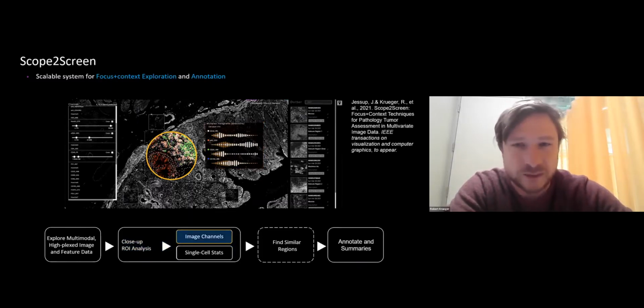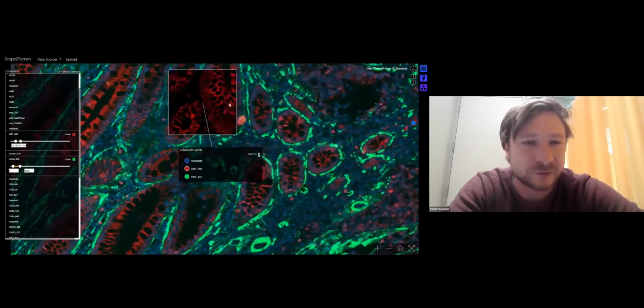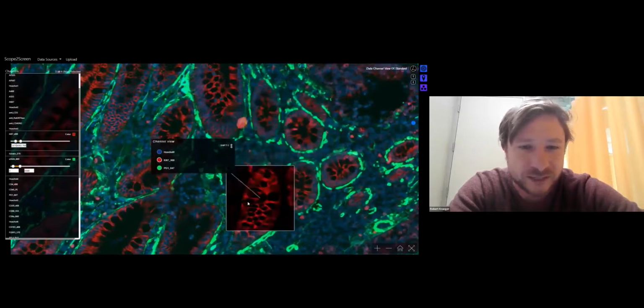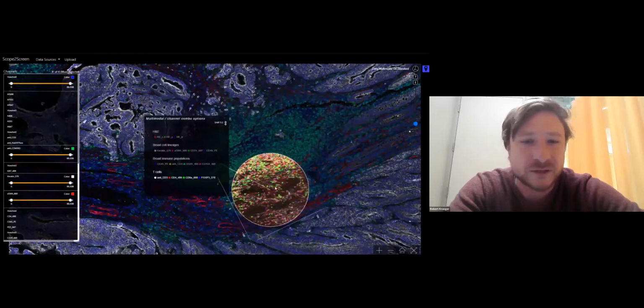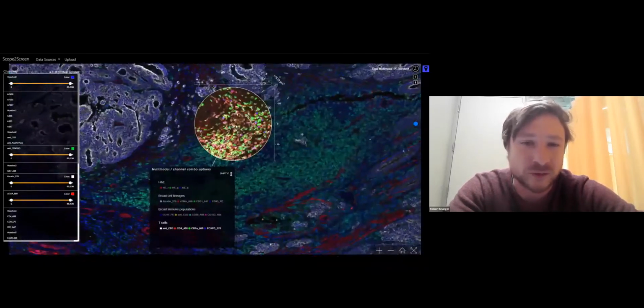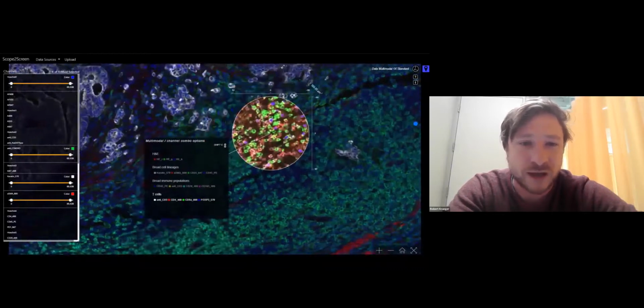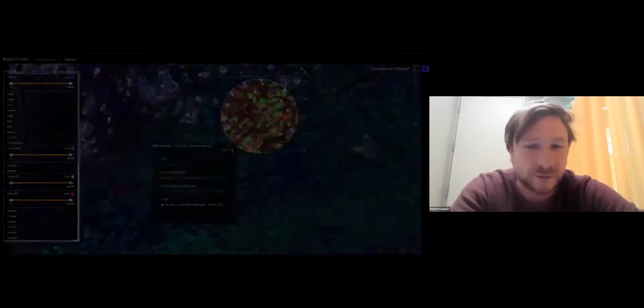First of all, we have image-based features. So here you can, for example, see while 3 channels are active or 2, the user can use this lens to isolate a channel and to look at specifics, or the user can have a certain setting of immune markers within the lens while having a more immune-cancer tumor structure outside of the lens to look for immune-specific reactions in context.